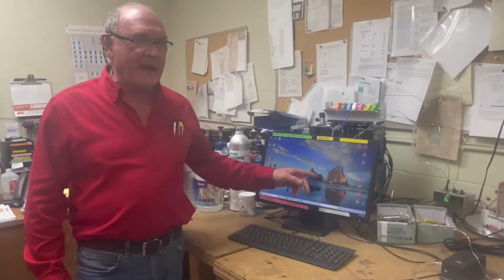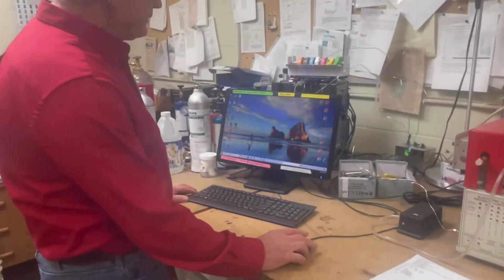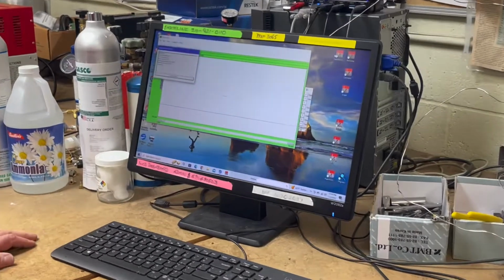I'm Hugh. In this video we're going to show you how to get data out of the PeakSimple program and into another program like Excel or Word or really anything, how to get the data out of PeakSimple and put it where you want. So I'm going to start by launching PeakSimple.